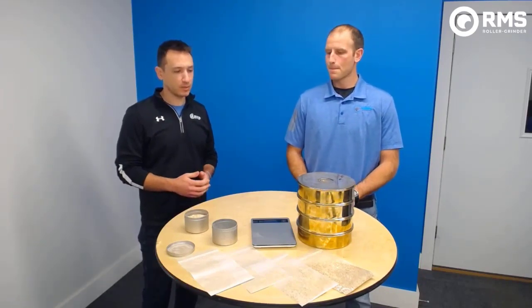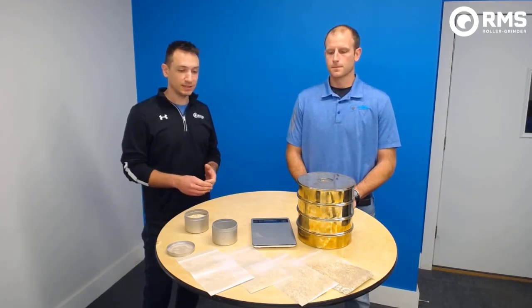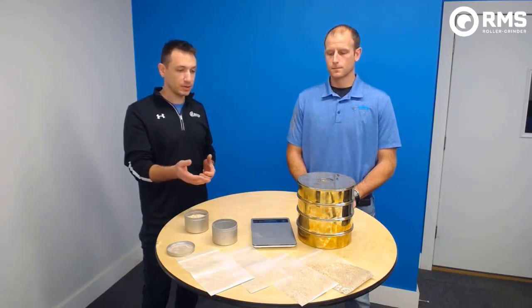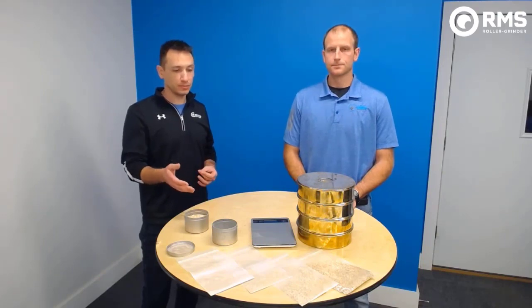Today we are going to talk about sieve analysis — or grist analysis, as it's commonly called. Generally speaking, why does a brewer want to go through and do this process? The main reason and biggest benefit of doing this sieve analysis is that this is your toolkit. This is how you measure what your grist looks like going into your brew house. Just like you have a hydrometer or refractometer to measure the gravity of your wort, this is how you measure the contents of your grist — to strive for consistency and ensure a good, quality, repeatable product.